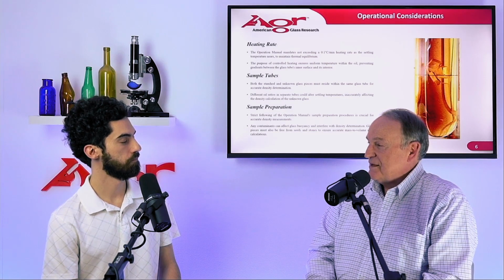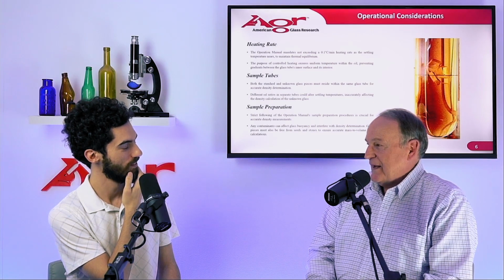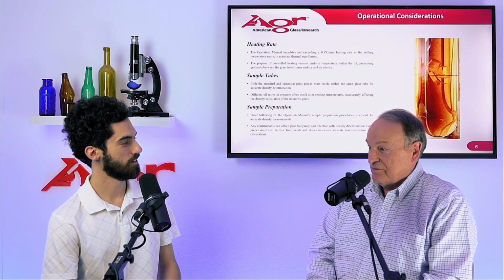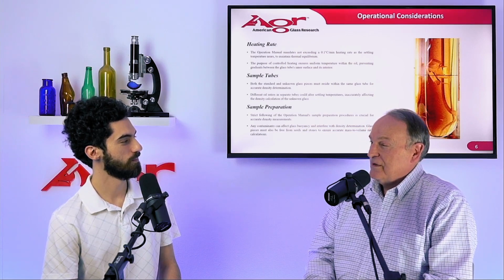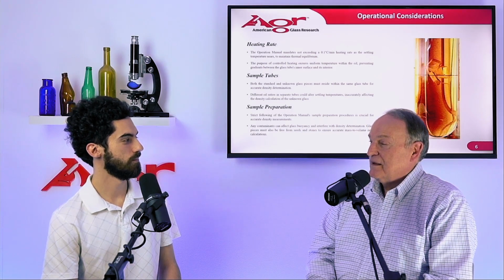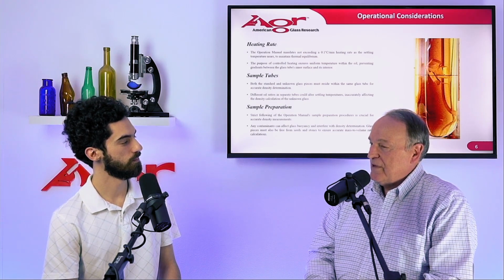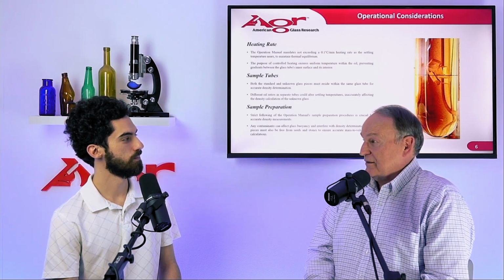Now, density is simply a measurement of the mass divided by the volume. The mass is easy, but the volume, that's the hard part. If you have a seed inside this piece of glass, the volume isn't going to change, but the mass will. Same thing with stone. If it's interior to these pieces of glass, you won't change the volume of those little pieces, but it will change the mass, and that'll upset the measurement of density. So you won't get a measurement of your composition, you'll get a measurement of some artifact.